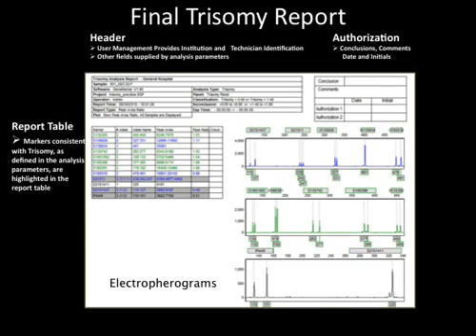The final trisomy report contains a header and an authorization box at the top, followed by a report table and electropherograms. To automatically enter the institution name and operator name or ID, please activate user management from the main screen's help drop-down menu, select user management, and follow the prompts. Details on user management are provided in the introductory GeneMarker webinar.